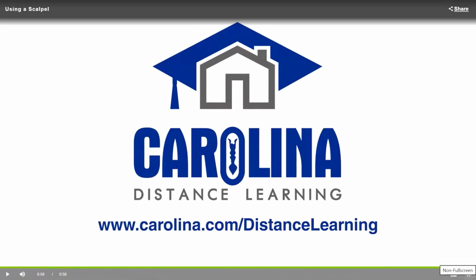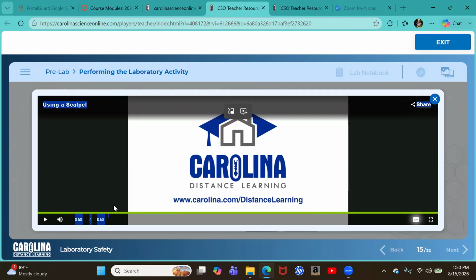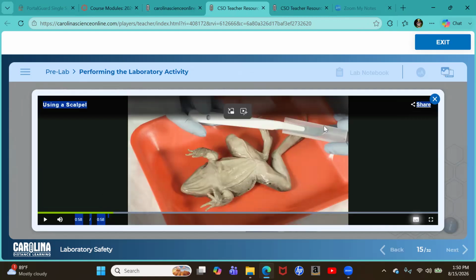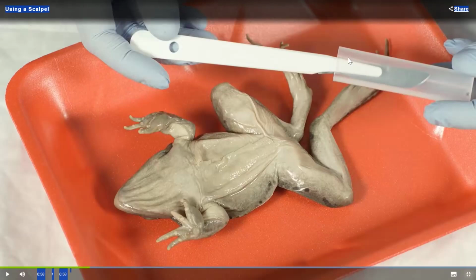Okay. Another thing to remember with the scalpel is the sheaths that come with them. I will forewarn you, please, when you go, I think we will only have one scalpel. Be careful with this sheath. Do not push the scalpel any further than is needed because this is a very thin plastic, or oftentimes can be. It depends on which one they use, and the scalpel can go through the edge here or the end of the sheath. So just be careful with that.